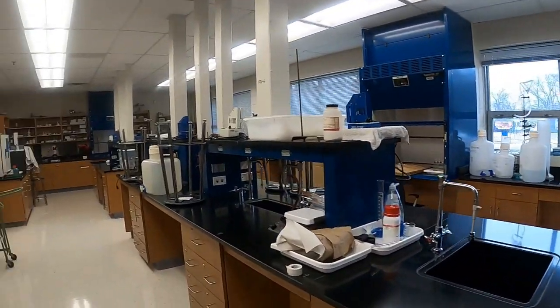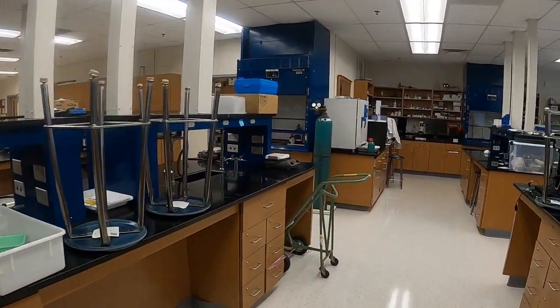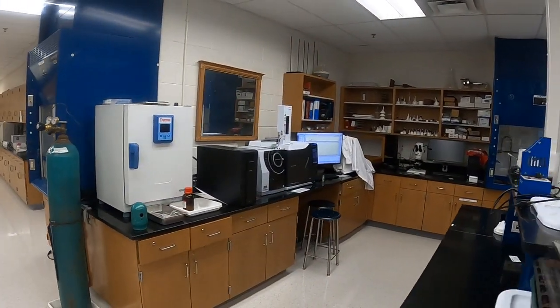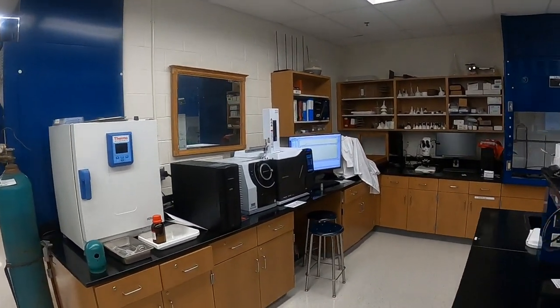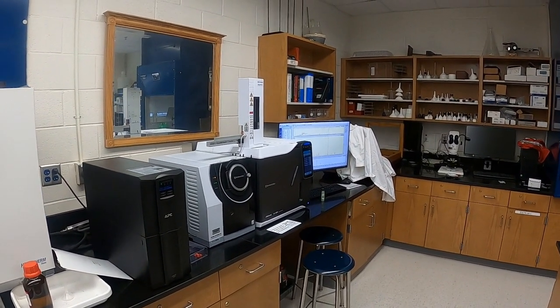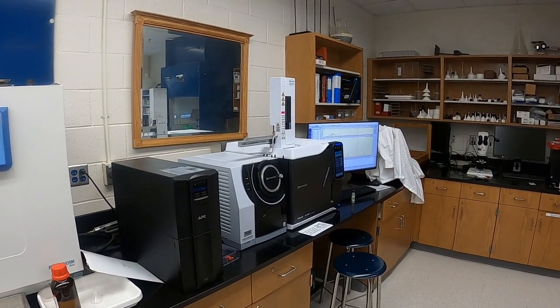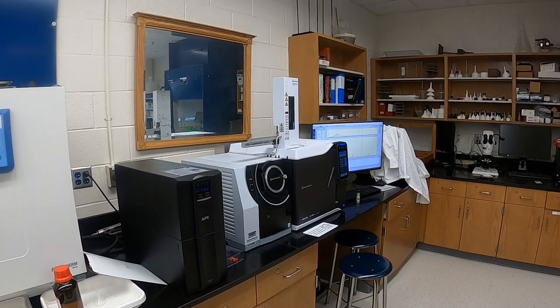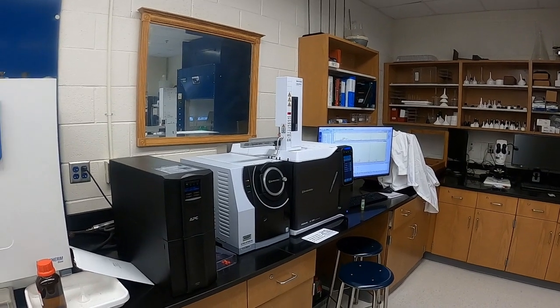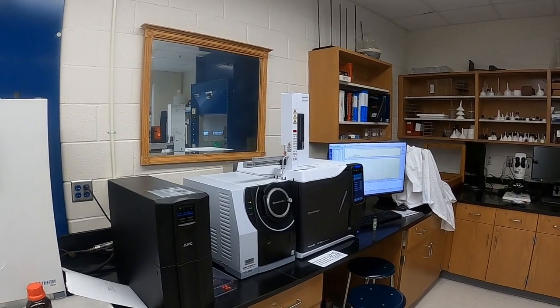So the lab is very well spread out and spacious, lots of room for project setup, equipment setup, student projects, lab work. Over here we have what's called a gas chromatograph mass spectrometer. It's a two-part instrument, gas chromatograph and mass spectrometer, or GCMS for short. The gas chromatograph provides a way to separate out mixtures of compounds in a sample. And then the mass spectrometer on the left-hand side is the detector to determine what compounds are actually present.